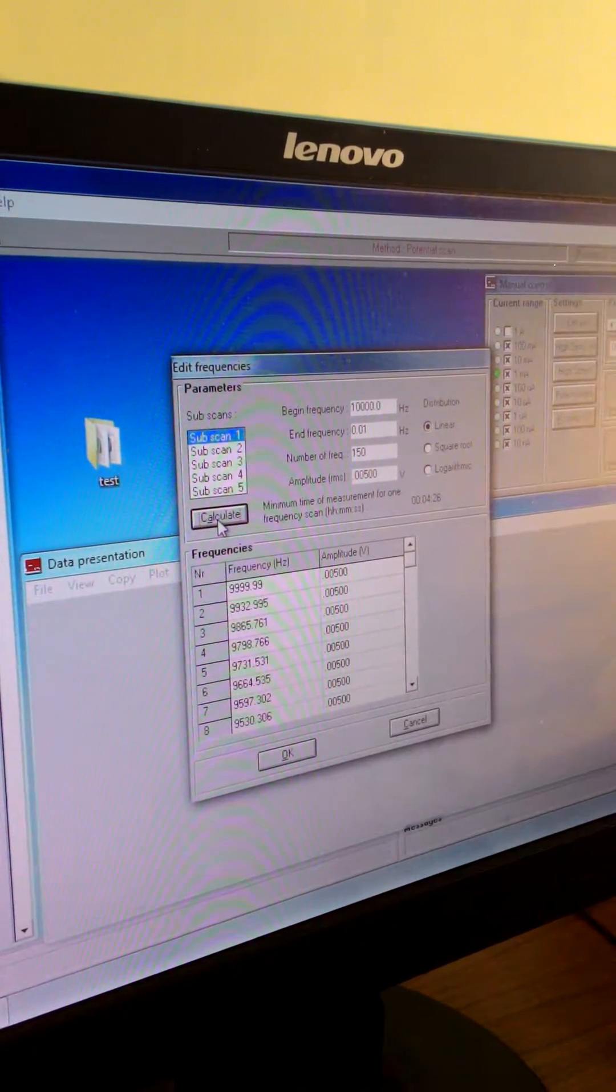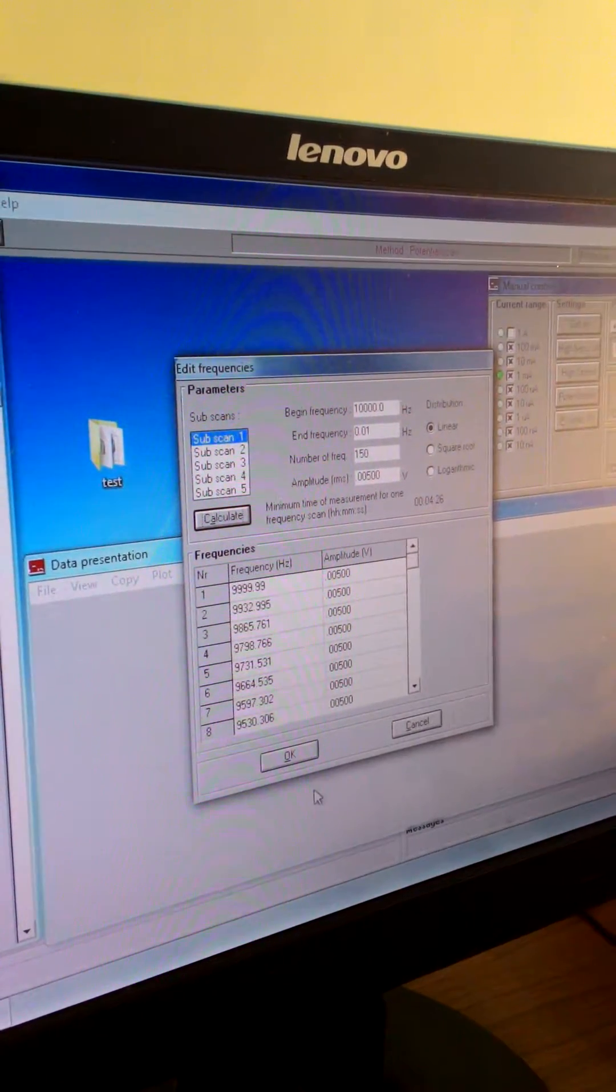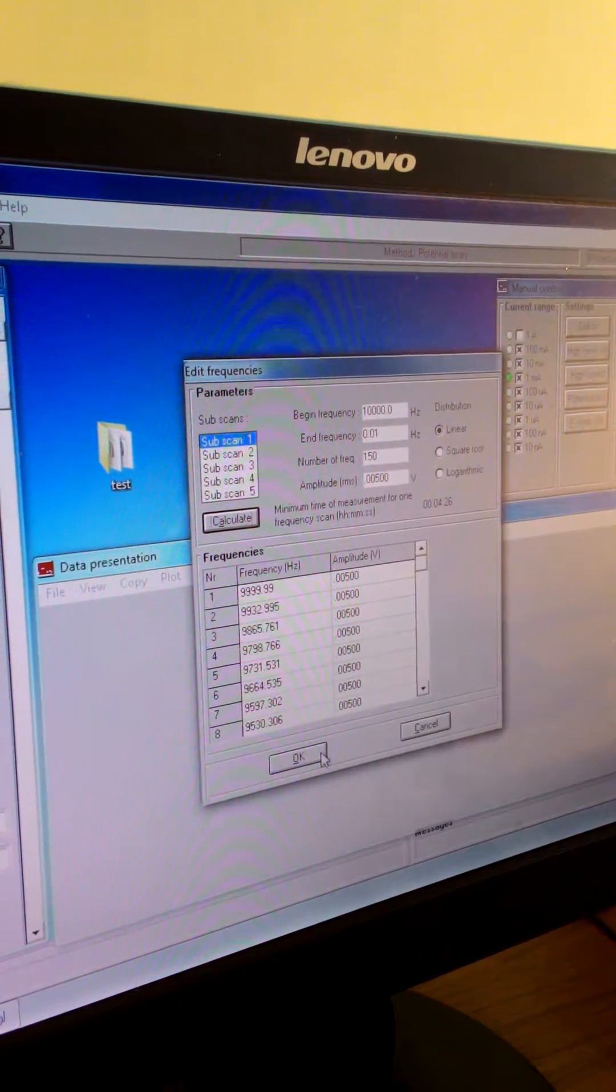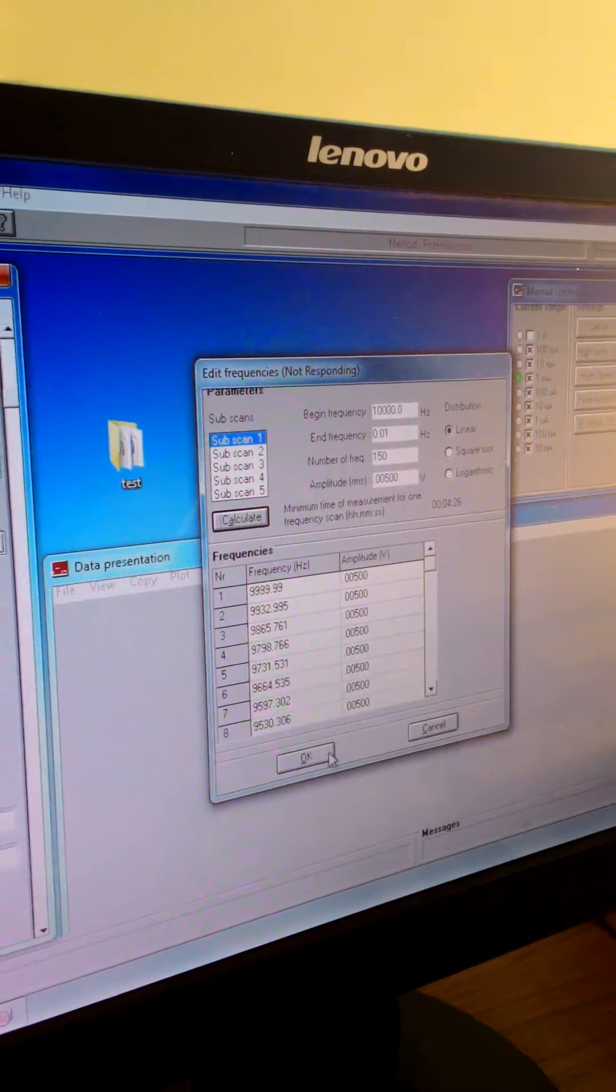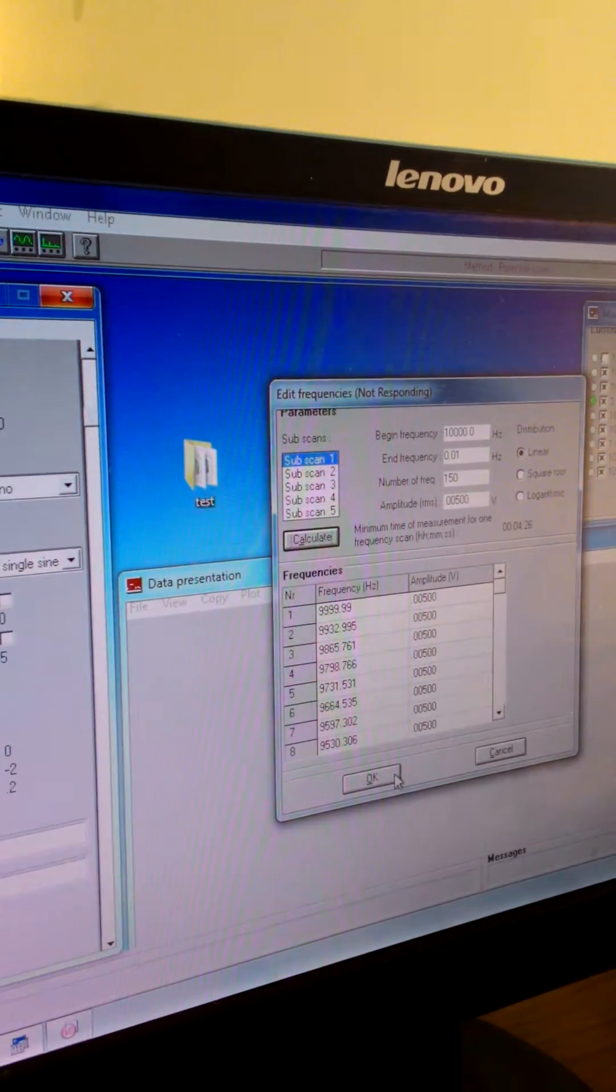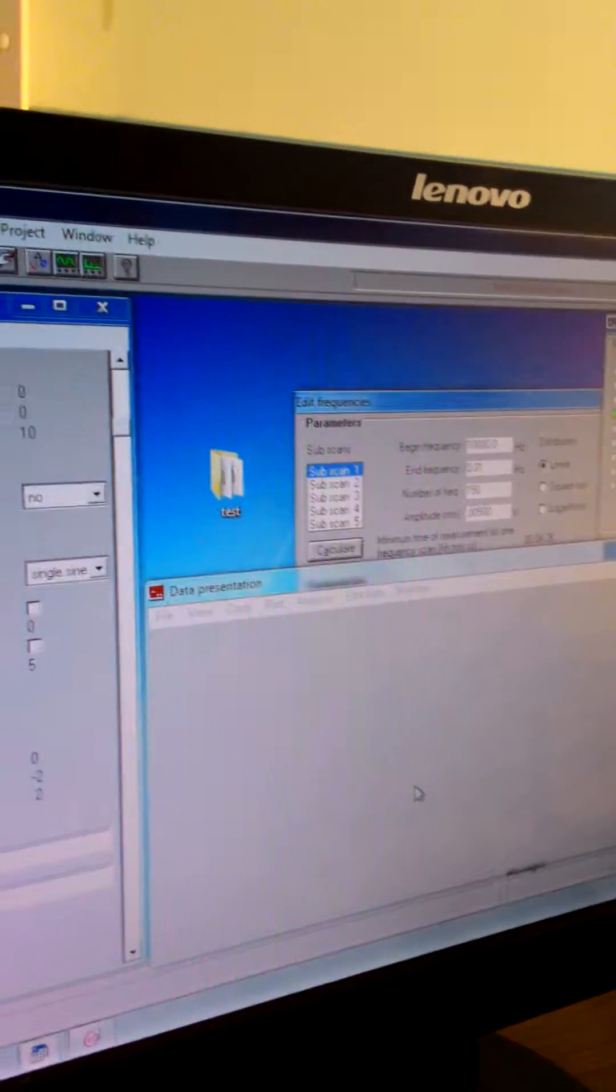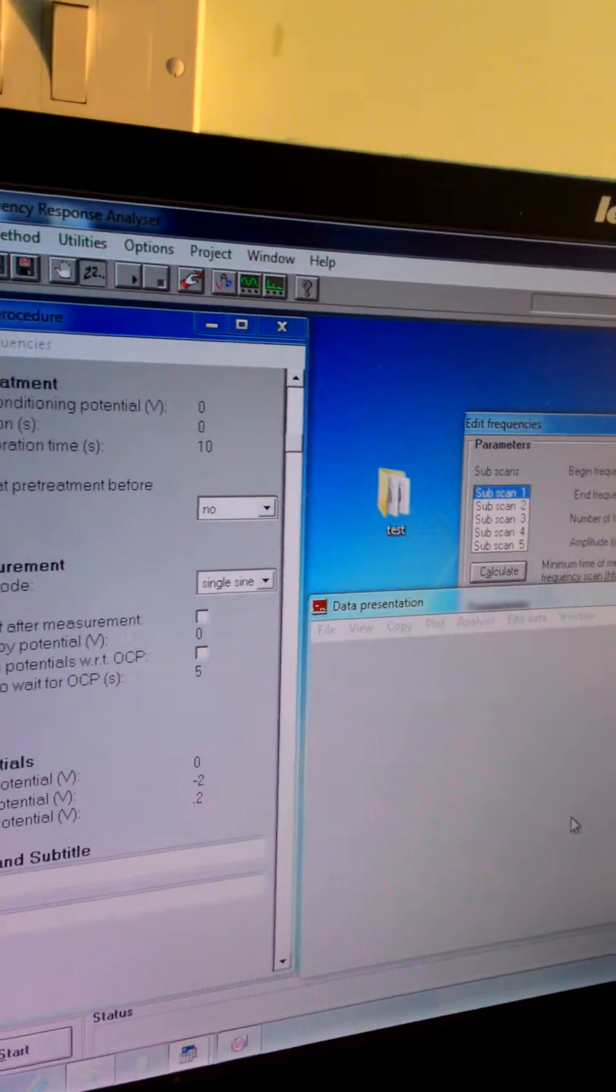And then, one thing you do, you just switch out this cell.